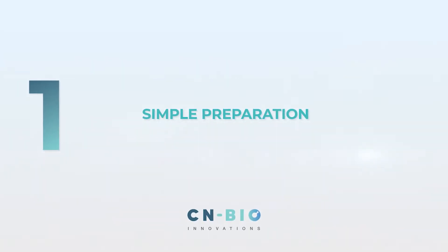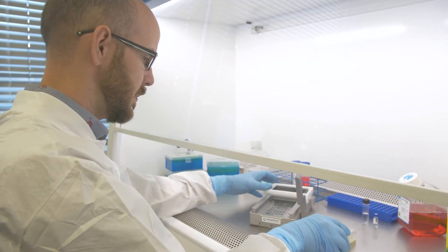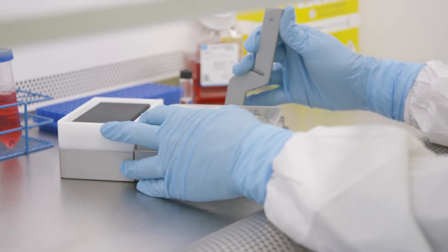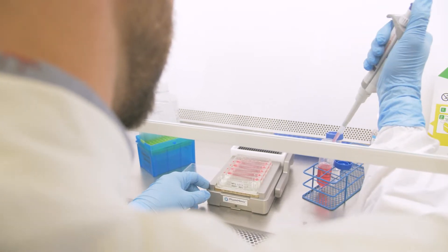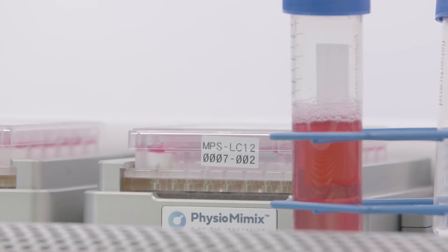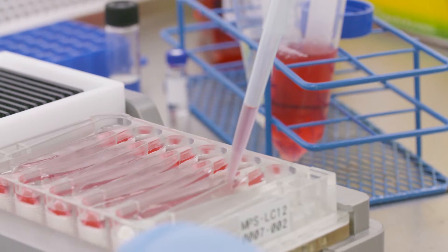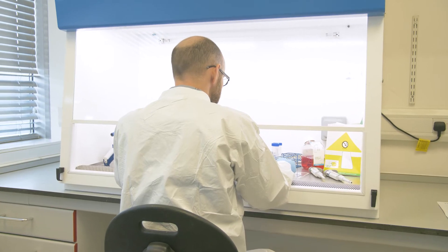Step 1: Simple Preparation. To get started with the PMXOOC, simply dock the MPS plate of choice onto the MPS driver. Once docked, prime the MPS plate with cell culture medium. All MPS plates contain microfluidics which control medium flow within individual cell culture wells. Using the liver MPS plate, different cell types of the liver can be seeded into 3D scaffolds to form tissue structures that mimic the function of the human liver.